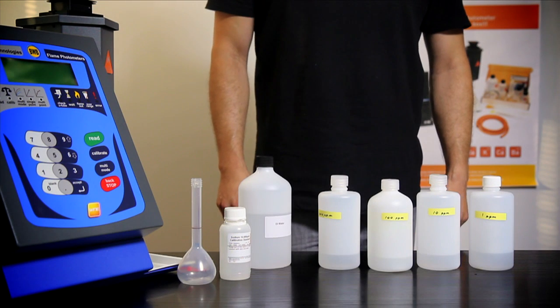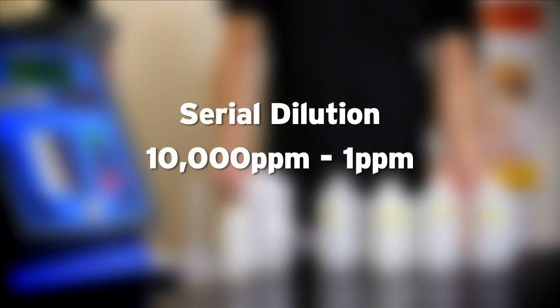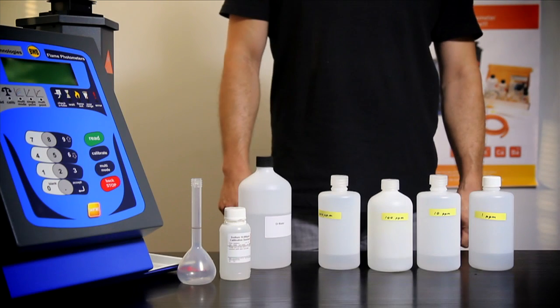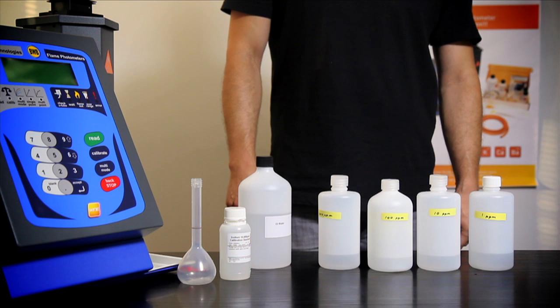Welcome to the BWB Technologies tutorial series. Today we will show you how to do a serial dilution from 10,000 parts per million to 1 part per million for use with your BWB XP flame photometer.